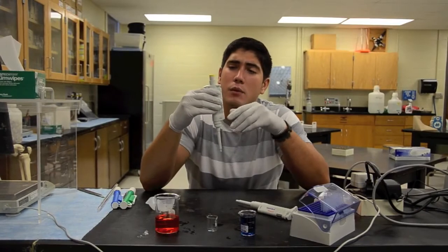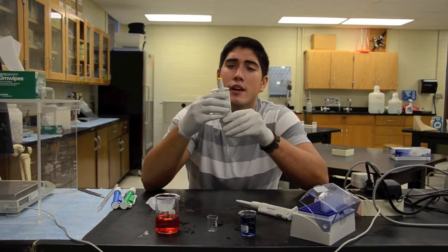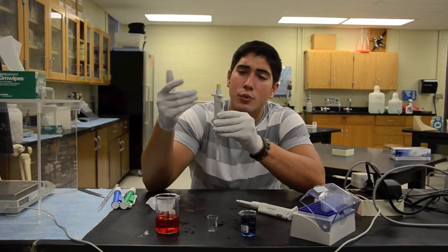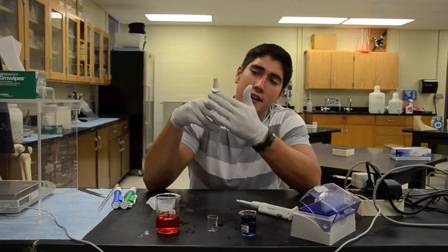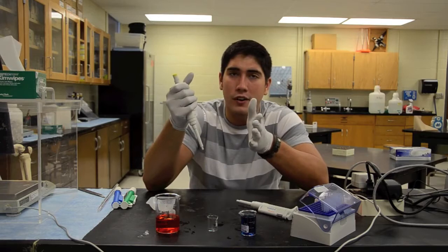Okay, first I'm going to help label the parts of the micropipette to familiarize you with using it in the lab. I want to start with the top, the volume adjustment knob. It goes from left to right, and you adjust it to whatever volume you need for the lab you're doing. As we go down, we have the handle right here. This is just so you can firmly hold it and make sure it doesn't slip or fall anywhere.